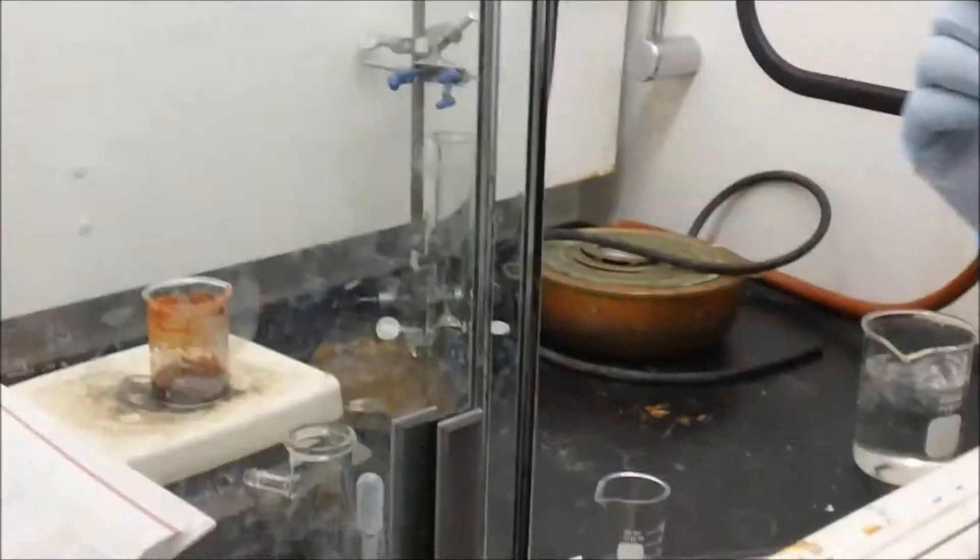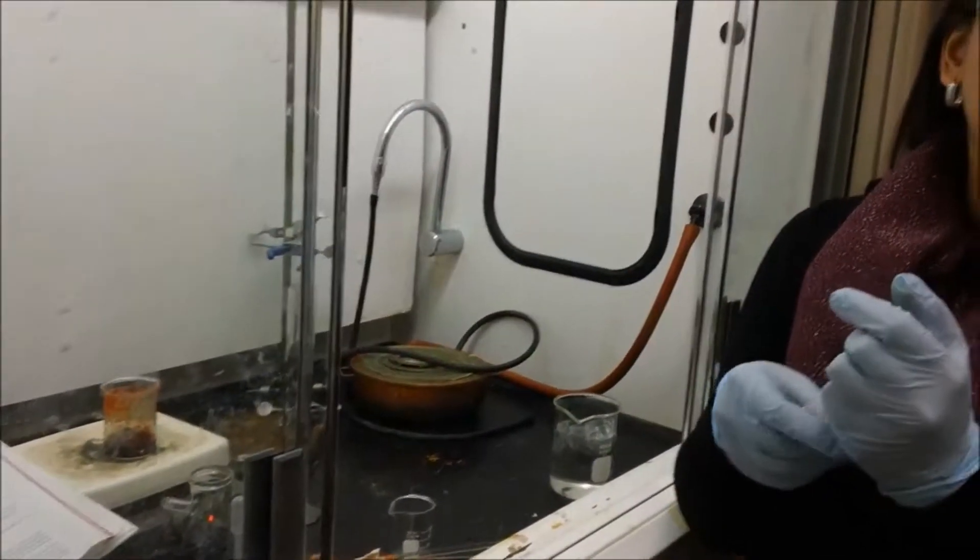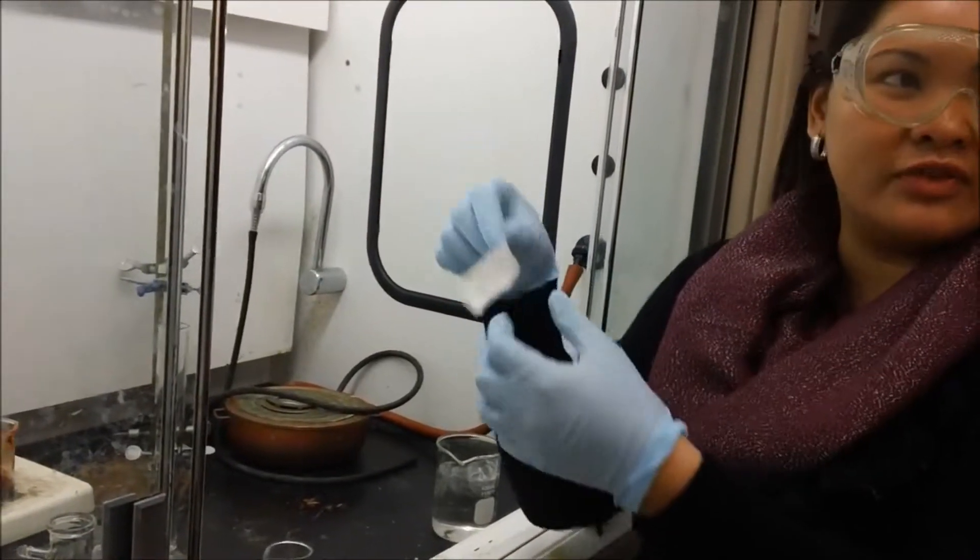What happens if it's a good dye — we wash it after it cools, and if it's a good dye then it wouldn't wash out, and then you'll see all different strips of colors and stuff.